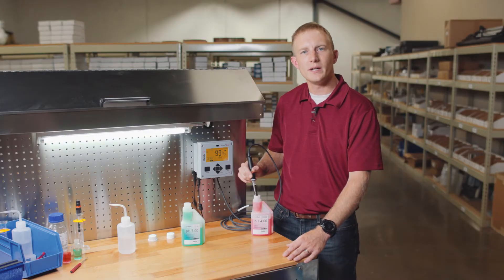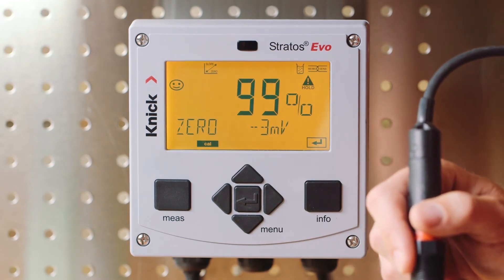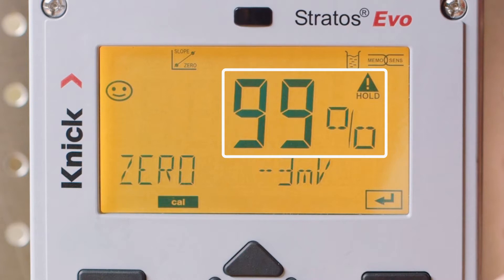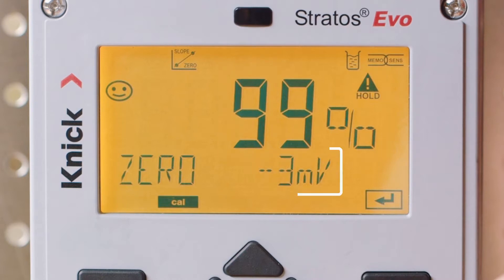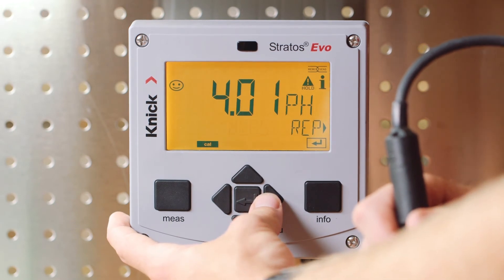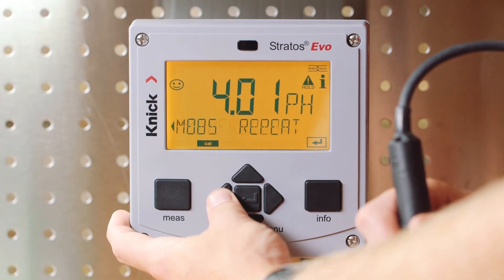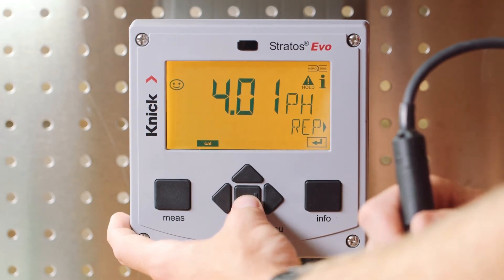Once the process is completed in our second buffer solution, you'll see that the Stratas Evo then provides the specific information of our calibration. First, we have our slope displayed in percentage, next our zero point displayed in millivolts, and finally a smiley face indicating a successful calibration. Press enter, and the Stratas Evo will now give us the opportunity to repeat our calibration process or write the calibration to our sensor by selecting measure.